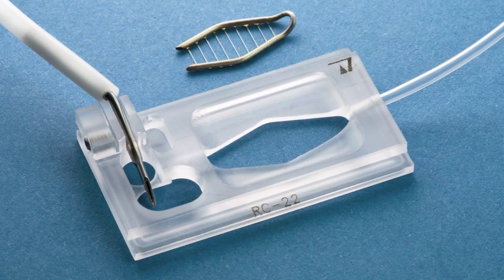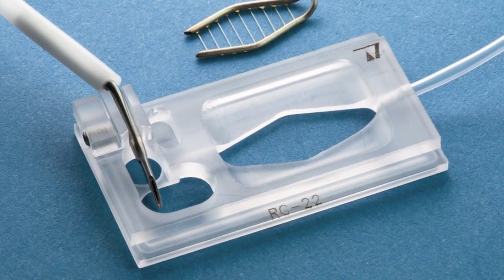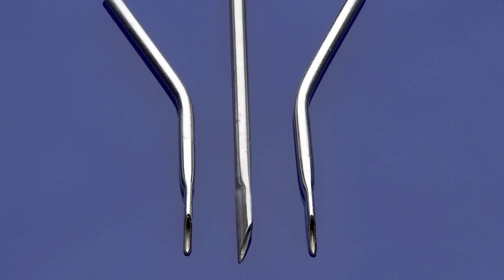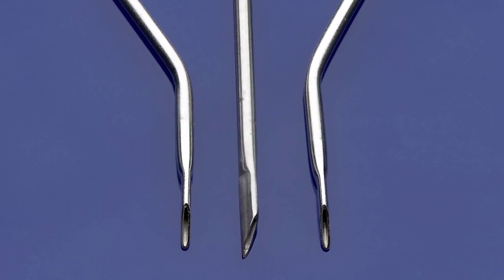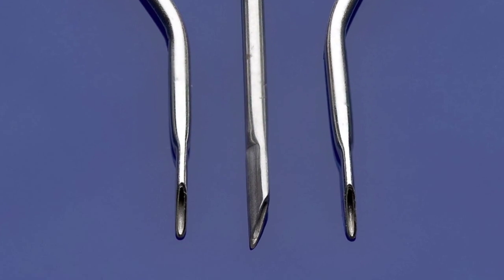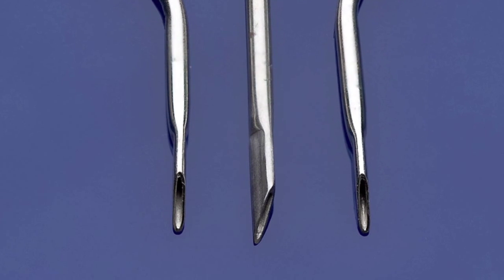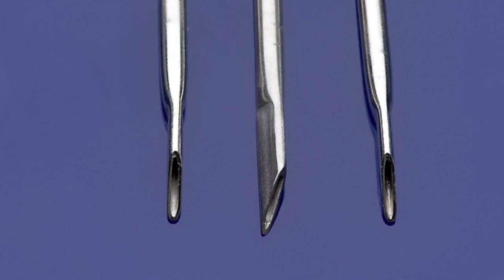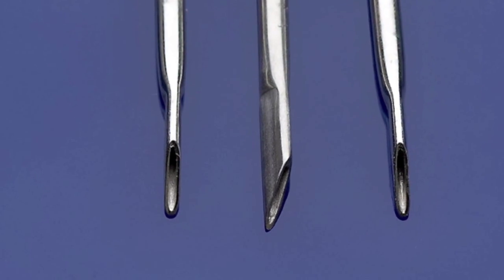The traditional suction tube design uses an open tip having a beveled edge that is oriented upwards. In this design, the tip of the sharp tube is used to break the solution surface tension, while leaving a large opening for the intake of both air and aspirant. This slurping effect is critical for proper aspiration of the chamber bath.